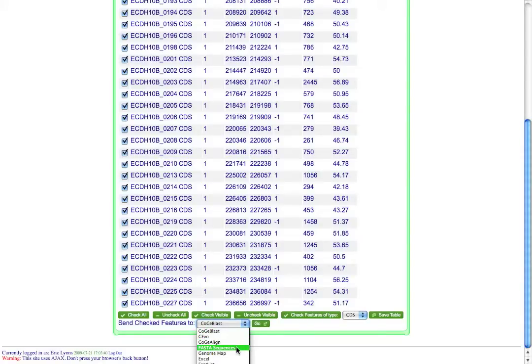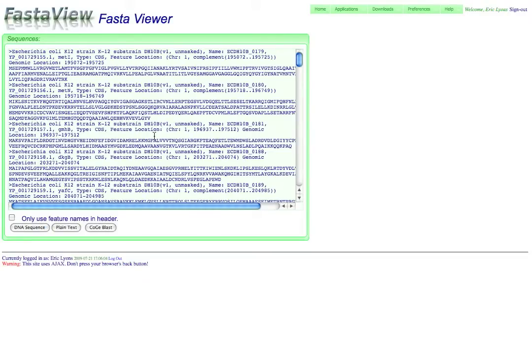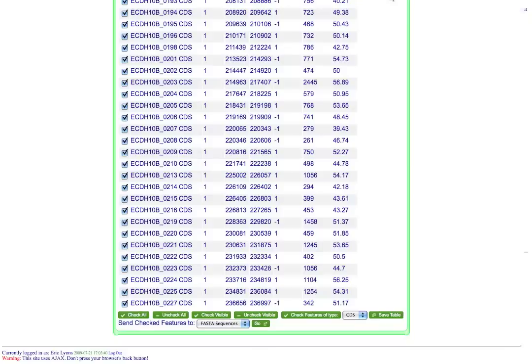If I wanted to get just the FASTA sequences, I could send it over to FASTA View, which is Koji's tool for viewing FASTA sequences. And I can get all of these sequences in FASTA format. This is also a nice tool because it lets me reverse complement or grab the protein coding sequences for them as well.